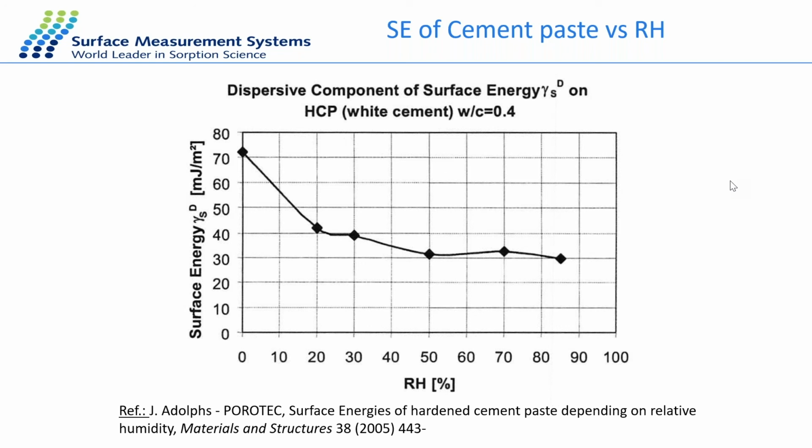Once I entered the initial BET, just an estimation of where I expect the BET. Based on that, the software will calculate the achievable range, and then I start with the highest and then go down to the lowest to get the whole adsorption isotherm.